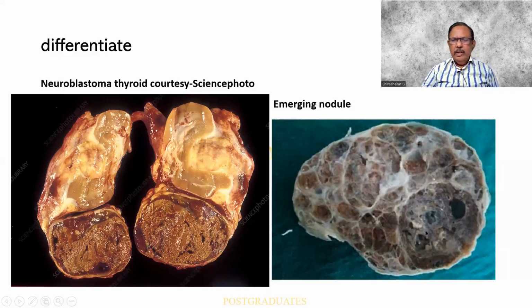Otherwise, it can be mistaken even for a dominant nodule, as you are seeing in a case of a multinodular goiter. So it is this kind of a thing. A nodular goiter, you should know what kind of histology it has. I would like you people to kindly visit Ackerman for the varying stages of the genesis of the thyroid tissue.